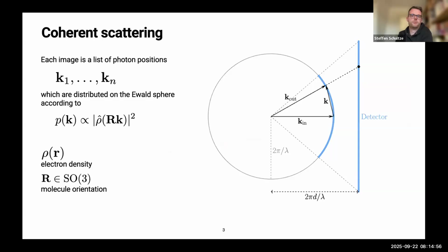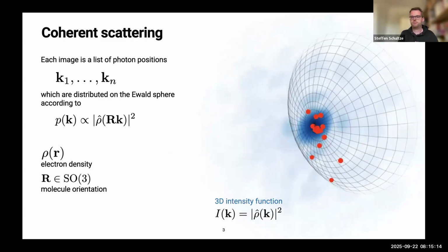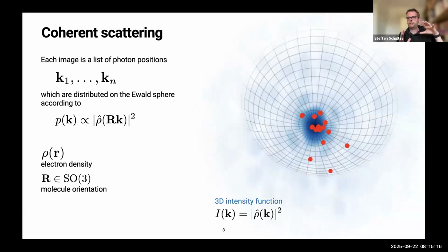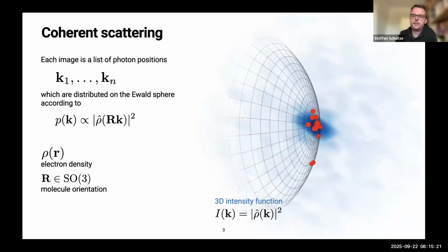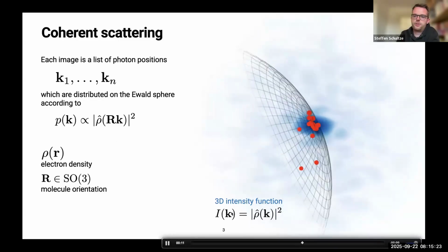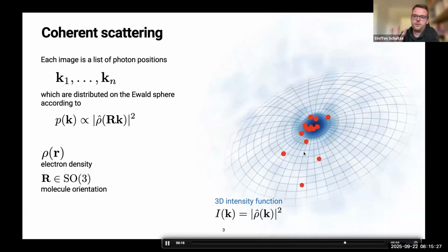If we look at this from a more mathematical perspective, each image is basically just a list of positions of photons in Fourier space, which are distributed according to the Fourier transform of the molecule. Due to the geometry, each orientation corresponds to one such Ewald sphere through the three-dimensional Fourier transform, and the photons' positions fall on this.